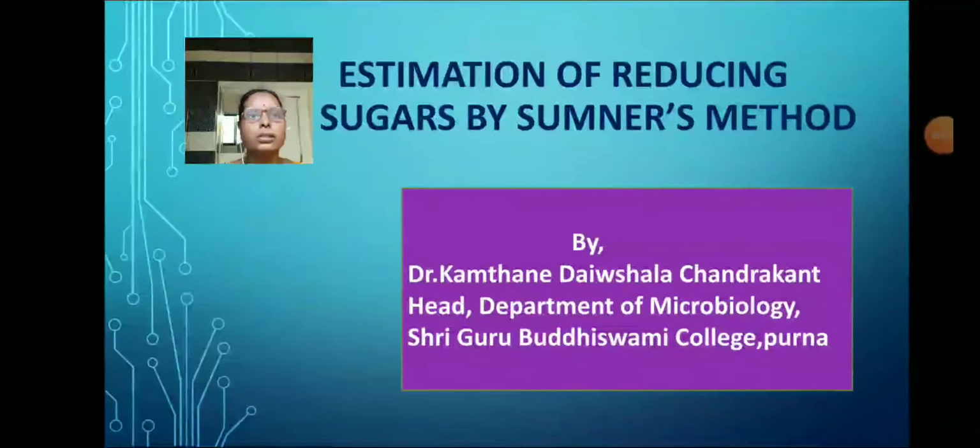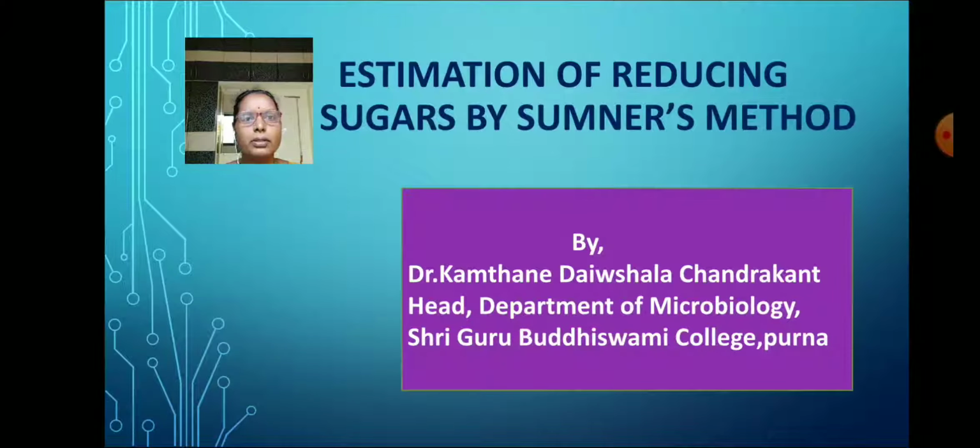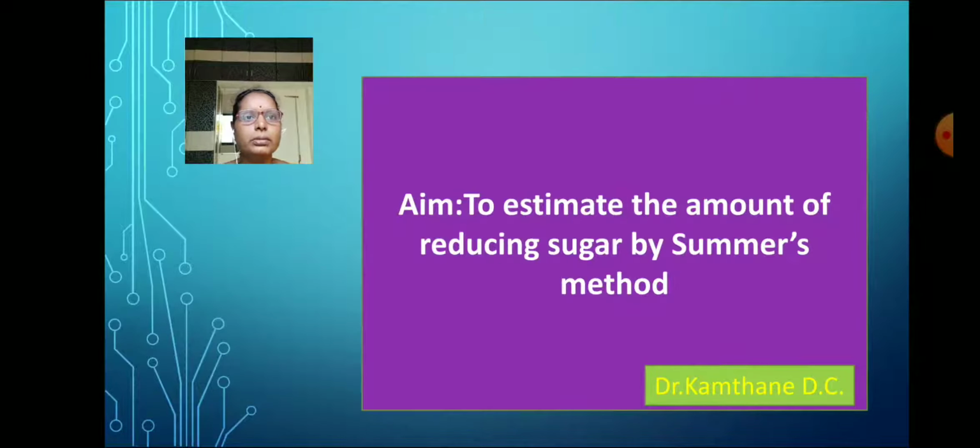Hello, we discuss the estimation of reducing sugars by Sumner's method. Myself, Dr. Kamthane DC. Aim: to estimate the amount of reducing sugar by Sumner's method.